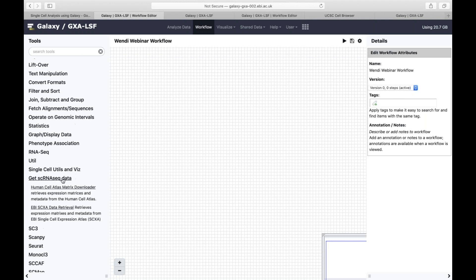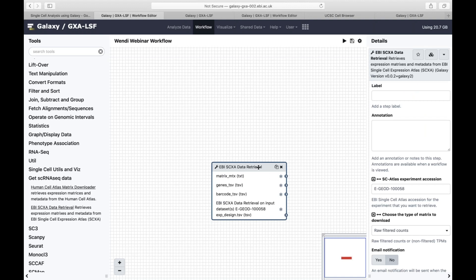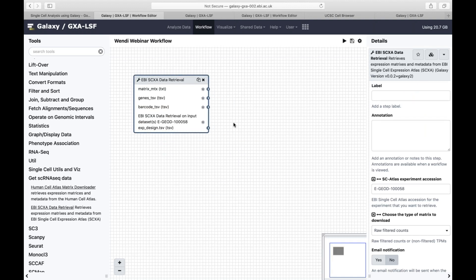We're going to start with getting data, so I'll go over to 'Get Data' and then retrieve data from the Single Cell Expression Atlas. If I click on this, we're now starting to build our workflow. At the top here is the output from this retrieval tool: you're going to retrieve your matrix — cells, genes, and transcript levels — your genes table, your barcode table, and your experimental design, which covers things like disease, sex, or individual.